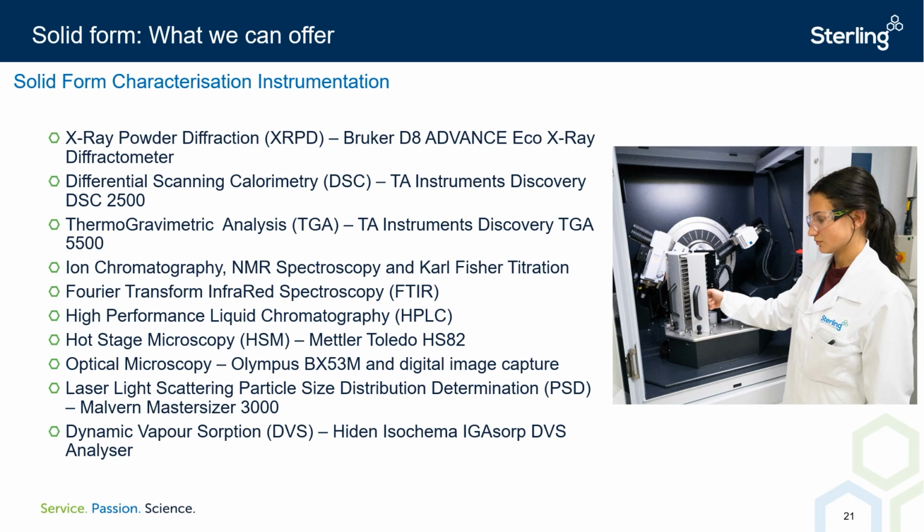This is useful for measuring the solubility profile of an API version, though determining the metastable zone width, that is, the solubility range between the API solution entering saturation, the point at which crystallization can occur, to supersaturation, where crystallization is spontaneous and uncontrolled, can be challenging. However, equipment does exist that can determine the solubility profiles and metastable zone width of an API version under given conditions via turbidity.